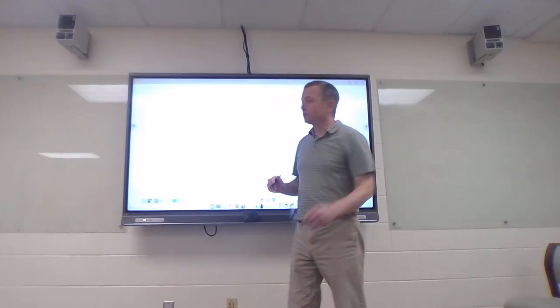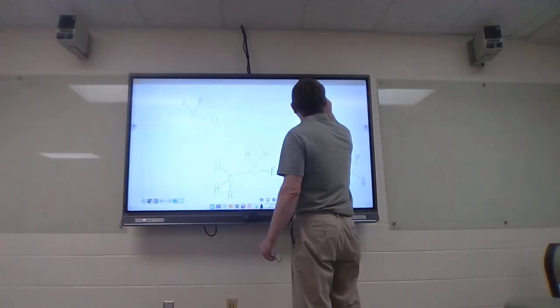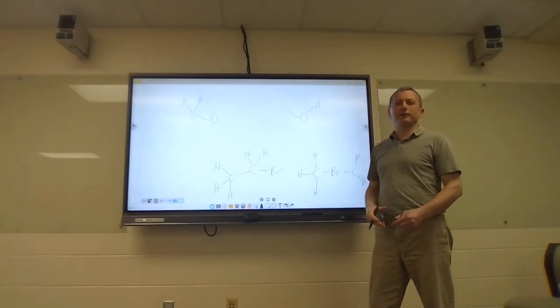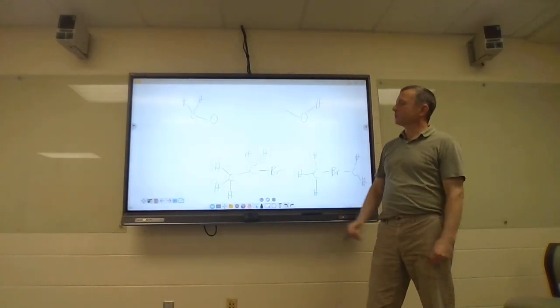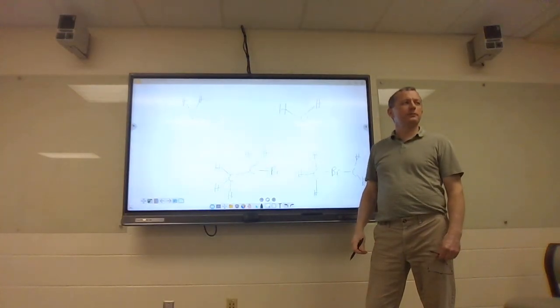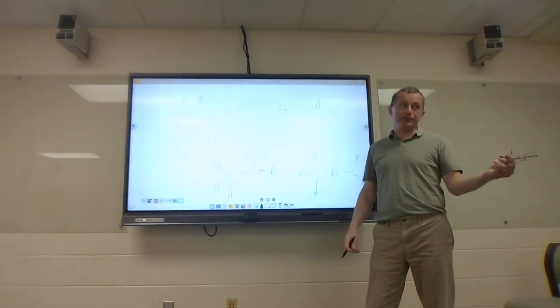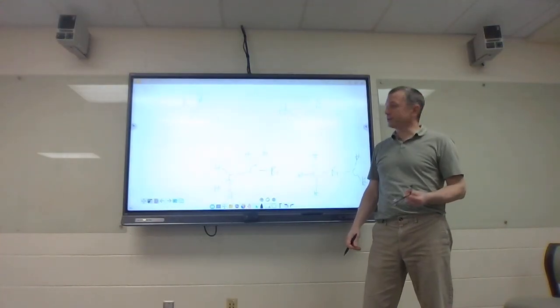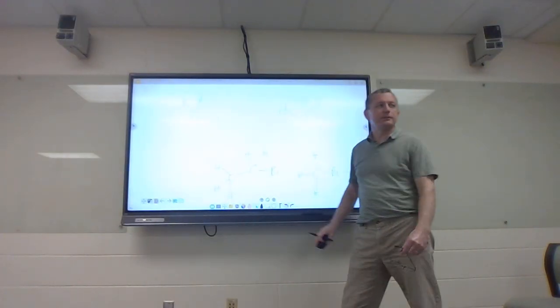Okay, so fine. We'll do what Julian wants. Oxygen wants to have how many bonds? 2. So, is that your molecule? You made 1? Because that peak is integrating to 2 hydrogens. There has to be 2 hydrogens.